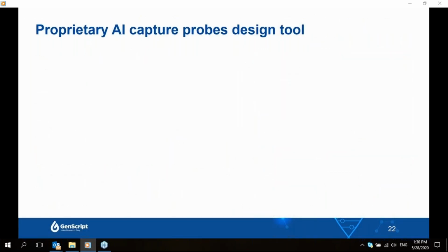Now I'd like to switch gears slightly and talk about the work we have done to improve the way capture probes are designed computationally. As we have seen, against the same target regions, probes from different synthesis technologies show different performances. We have also internally proven that when adjusting for regions and technology, the placement of the probes also has a huge impact on the final capture performance. And here's how it works in general.